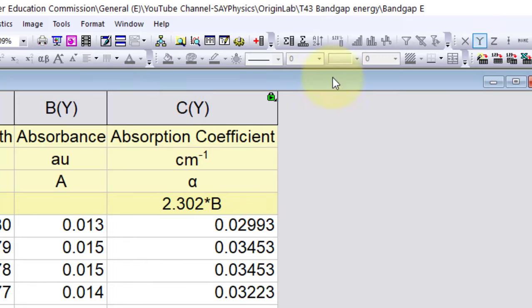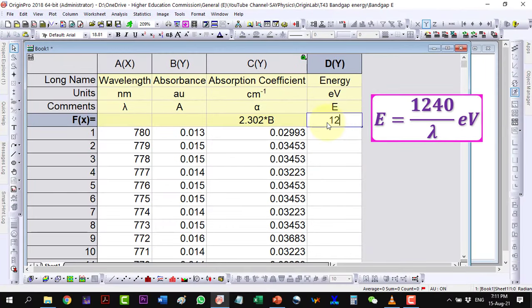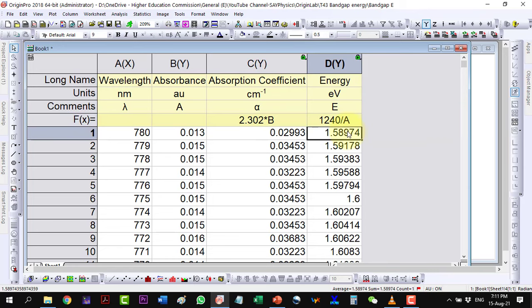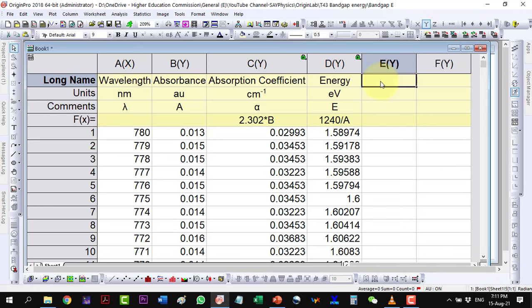To calculate the energy h nu, we add another column. Now, we will add a couple of columns to find alpha h nu power 1/2 and alpha h nu power 2.